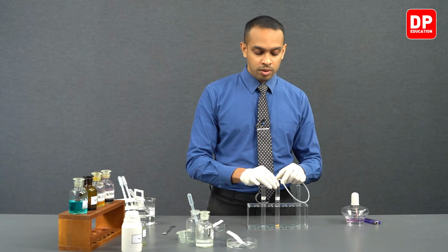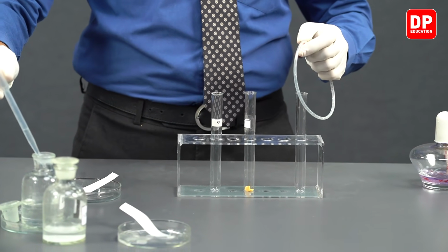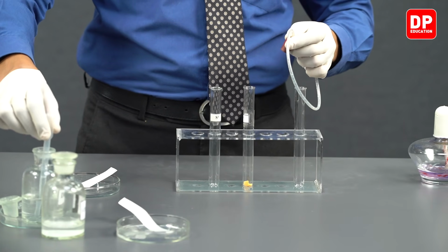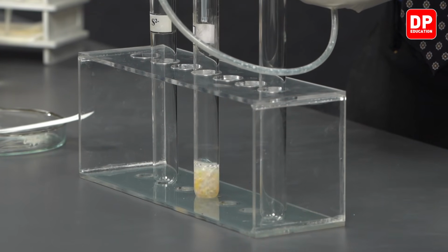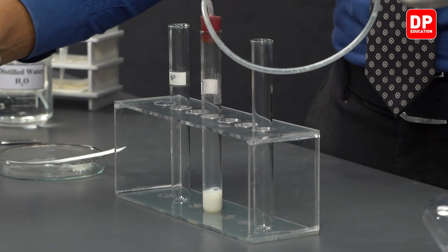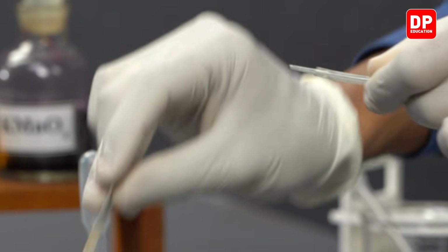Now, let's move on to that step. We are going to be adding HCl. As soon as we add HCl, we are going to place the stopper. And now we are going to take our filter paper soaked in lead acetate.